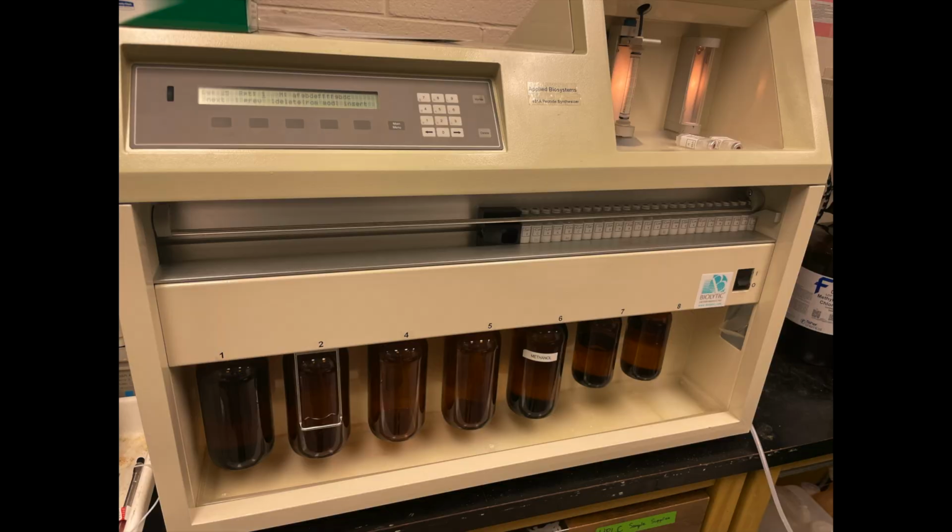Moving on, now we're showing the cyclical nature of the process: you're continually adding these amino acids onto the back of each other. The machine you use for this is a peptide synthesizer. You can see a bunch of different containers with different reagents, big jugs of other chemicals, and it's hooked up to gas and all that. It's more complex than I'm letting on. But you can see all of these tiny little vials filled with different amino acids, and they're going to be added on sequentially.